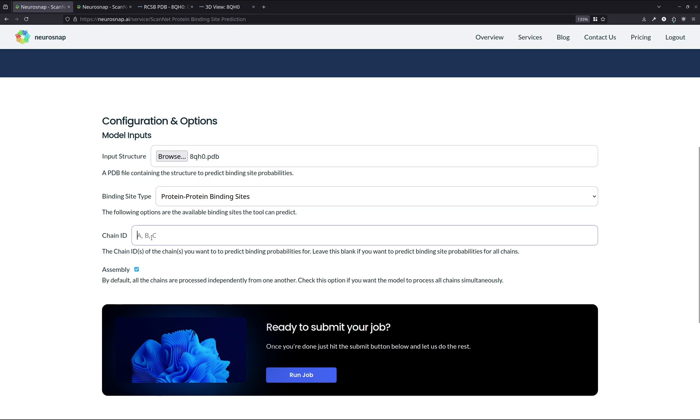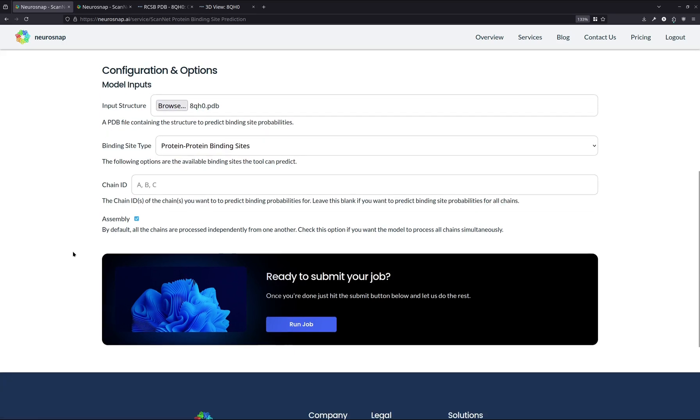Chain ID essentially allows you to specify which chains you want to pass into the model. If you leave this empty, then all chains will be passed into the model and the model will predict the interaction site probabilities for every single chain. This is what we want to do for our demonstration, so we're just going to leave this empty.